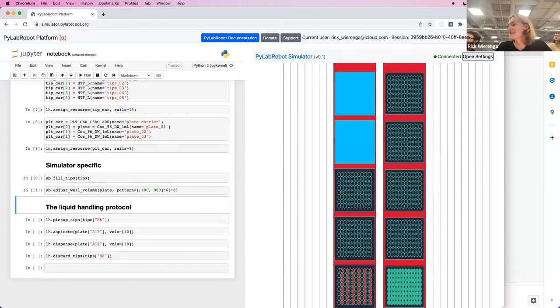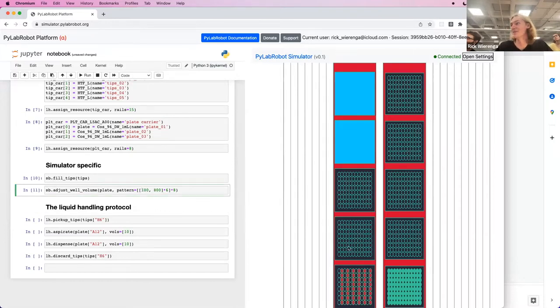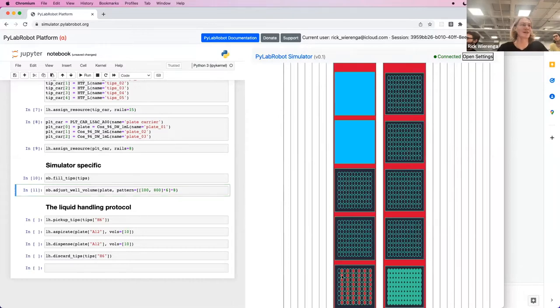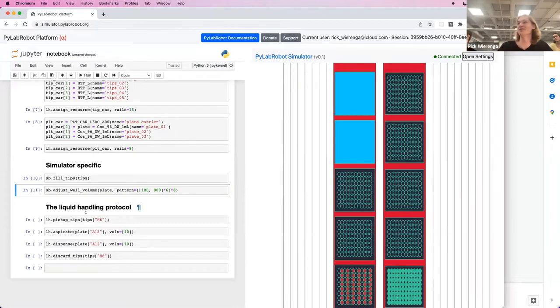You can see here that since we have alternating 100 and 800 microliters of volume, that the opacity of the wells will reflect the amount of liquid in a well as the visual cue.